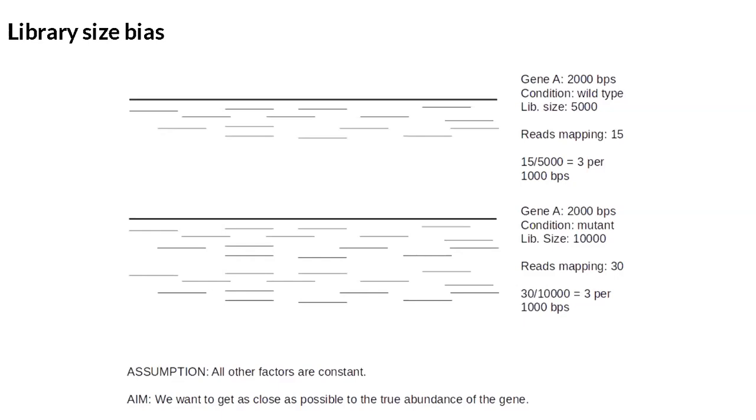That's what we discussed, right? The filter that we applied last time when we were converting the SAM to BAM, the mapping quality filter. If you have a mapping quality of 0, that means it's multiply mapped. So in RNA-seq, you then really have to take a call. Ideally, it should be uniquely mapped reads, but at least in eukaryotes you have things like isoforms, so the same read can be coming from different isoforms as well. So you have to see that. Right now, let's assume that these are all uniquely mapped reads.